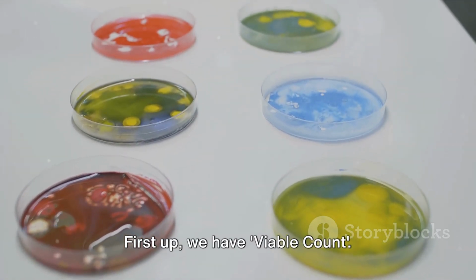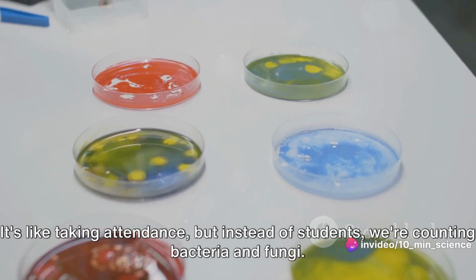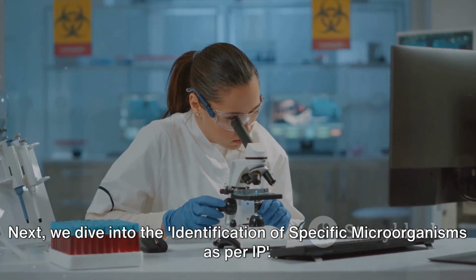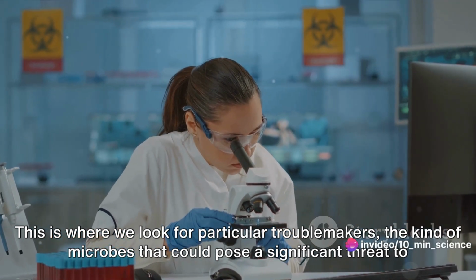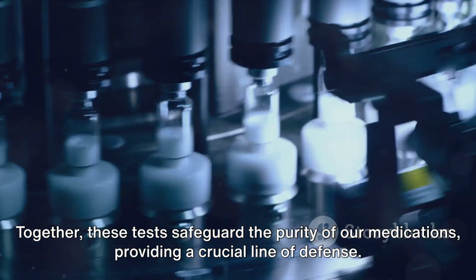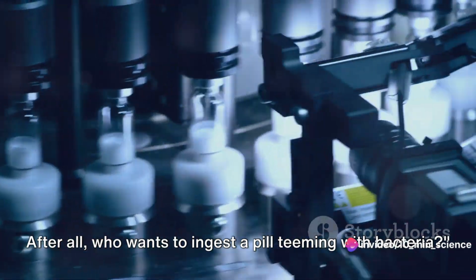First up, we have viable count. This is our head count of living microorganisms in a sample. It's like taking attendance, but instead of students, we're counting bacteria and fungi. Next, we dive into the identification of specific microorganisms as per IP. This is where we look for particular troublemakers, the kind of microbes that could pose a significant threat to human health. Together, these tests safeguard the purity of our medications, providing a crucial line of defense. After all, who wants to ingest a pill teeming with bacteria?